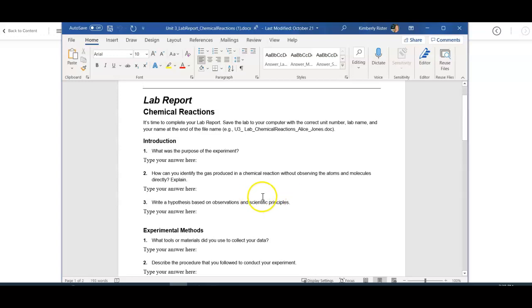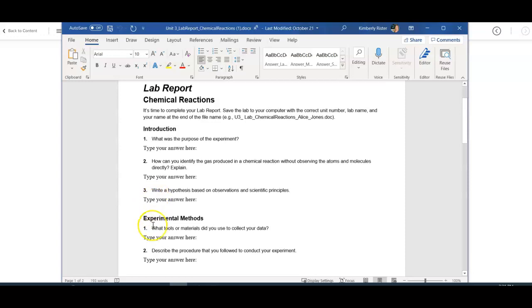Explain how to use a chemical property to identify, and what that's called. And then if we were writing a hypothesis based on what we were trying to do here, we know we've been trying to follow that: if I do this in the experiment, then I should be able to do this. So if I get a baseline and I'm able to determine some indirect properties that could help me identify a substance, then I will be able to identify the gas produced in the chemical reaction. Something like that. You're talking about what you're testing versus what you think the outcome will be.